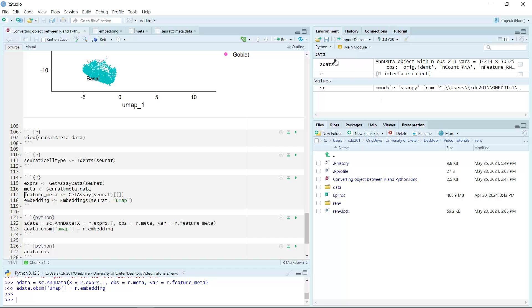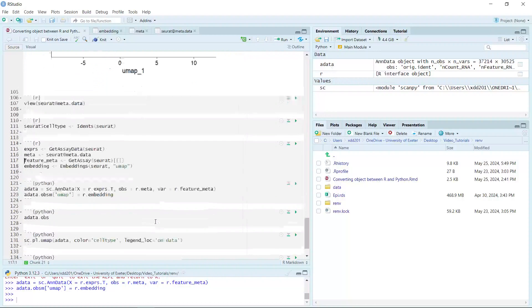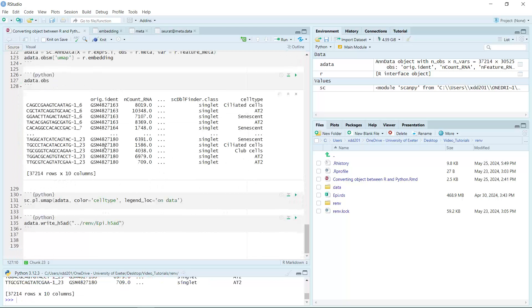You can see in my Python environment window, now we have the AnnData object. We created the AnnData object. Now we can have a look at the AnnData observations. You can see the row names are the cell barcodes. We have the orig.ident column as the sequencing ID, through to the last column which is the cell types. So we have the same metadata in the AnnData as in the Seurat object.